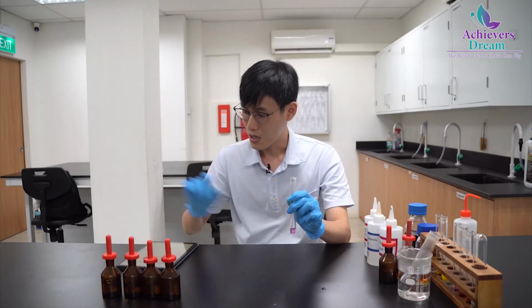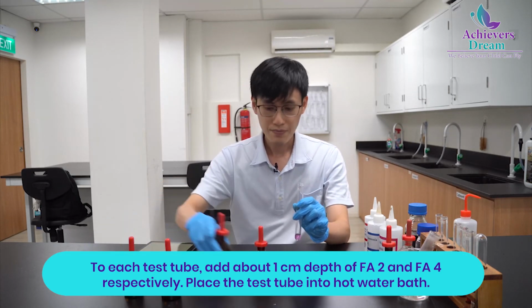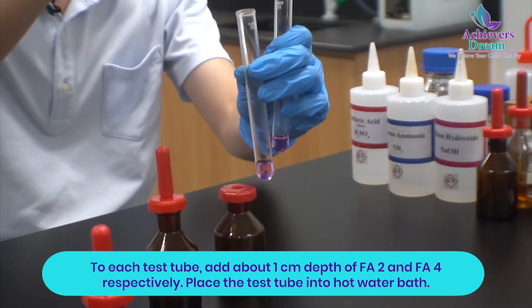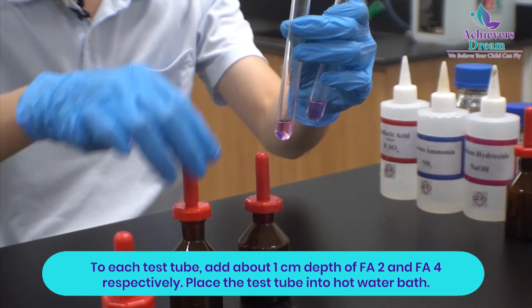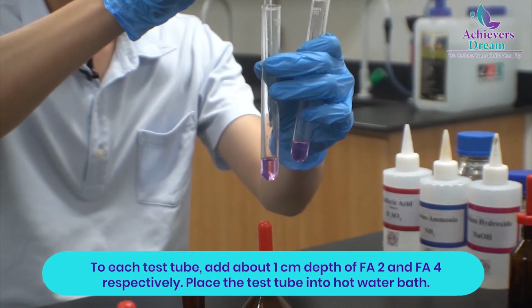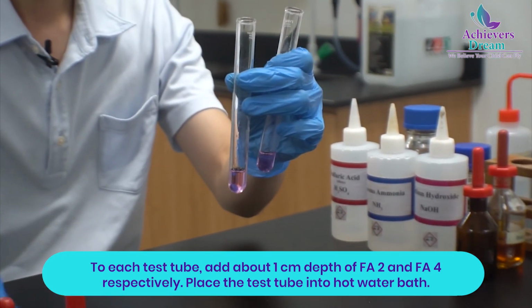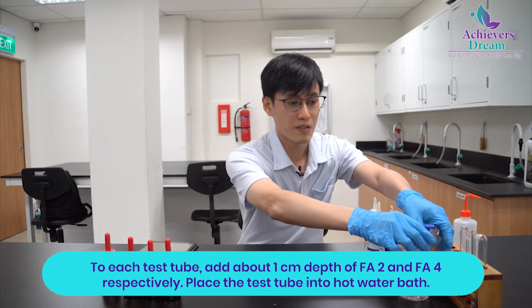So we'll be doing the KMnO4 test on Fa2 and Fa4. I have both my test tubes and I'm going to put some Fa2 into the one on my left and some Fa4 into the one on my right. Oxidation reactions require heating, so we'll be placing both test tubes in the water bath.